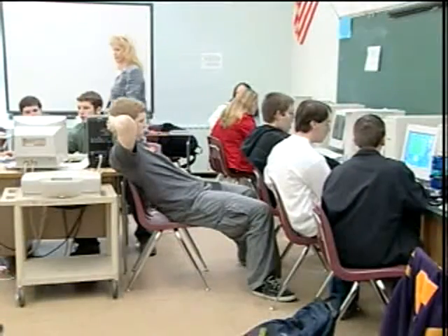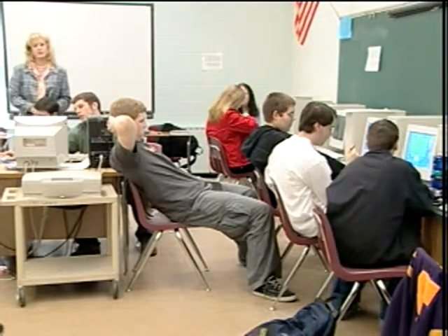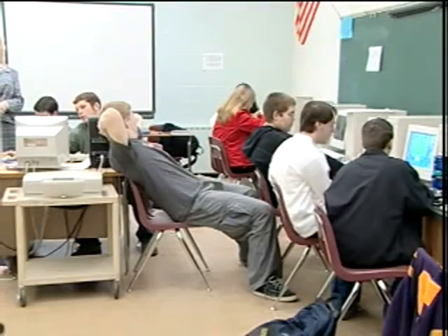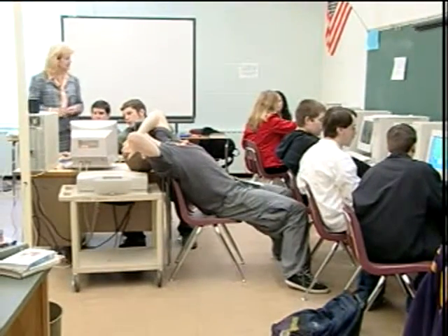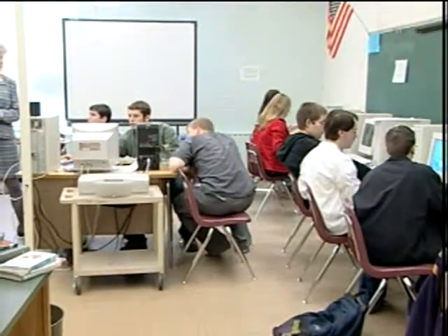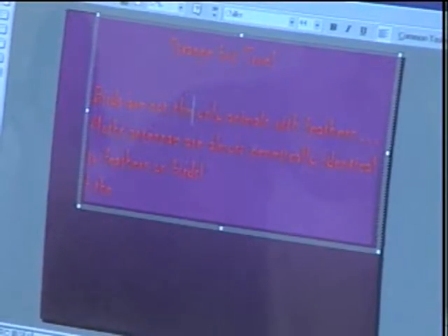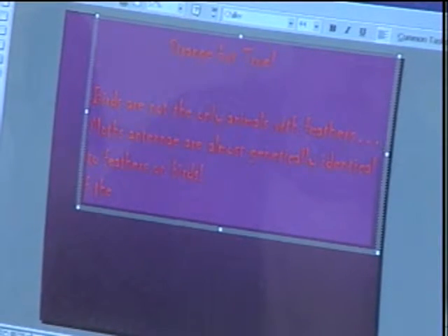The students are assigned a research project. They have to choose a topic that is related to biology and then use the microscopes to take pictures and short movies of specimens related to their topics. The students will also use the internet and books to gather information. All the pictures, movies, and information will be included in PowerPoint presentations.